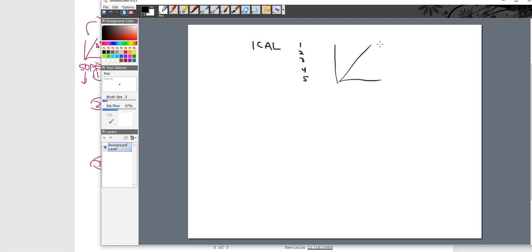Next up, we're now going to do an initial calibration verification, an ICV. When we run it, we get a number. That is processed like a sample. That is going to go into the calibration curve. We get a number based on the calibration curve that we've generated, and it gives me what that value is.